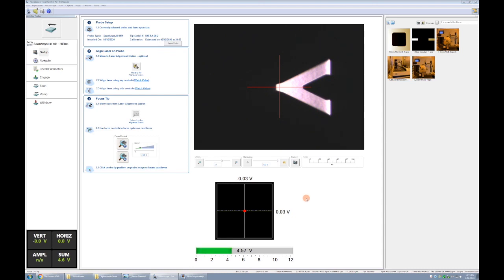We're now in the second video in our series on the introduction to using the Bruker Dimension Icon AFM. In this one we'll show how to navigate the sample over until it's under the scanner.